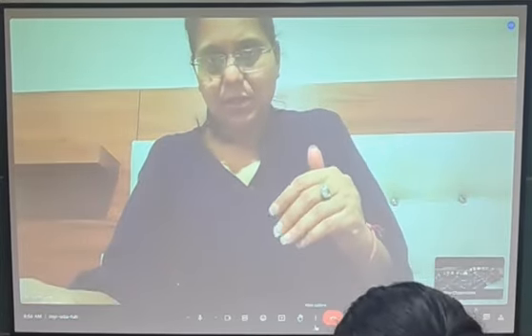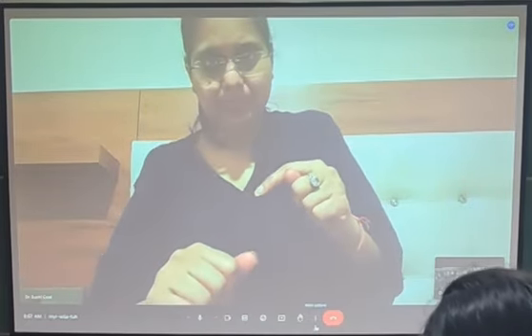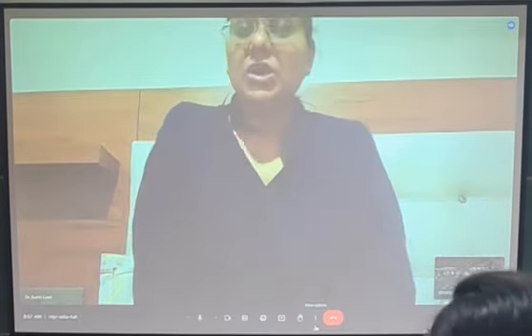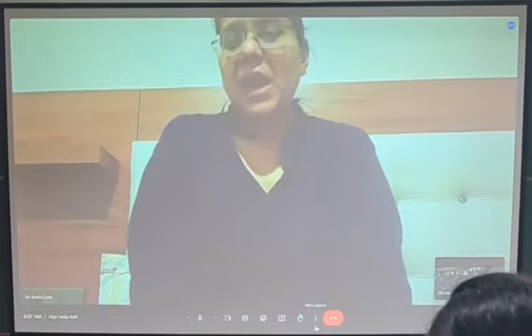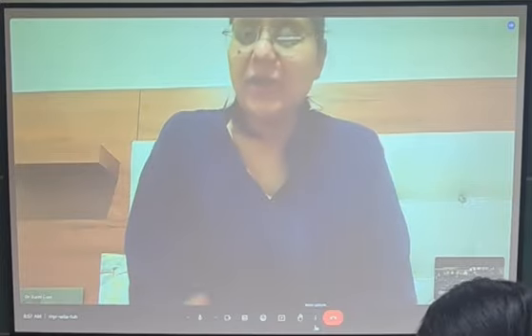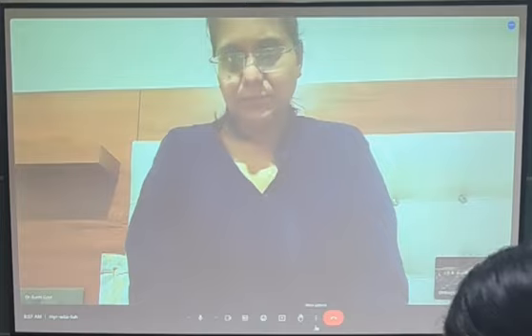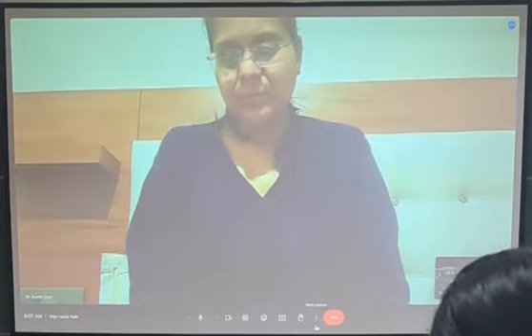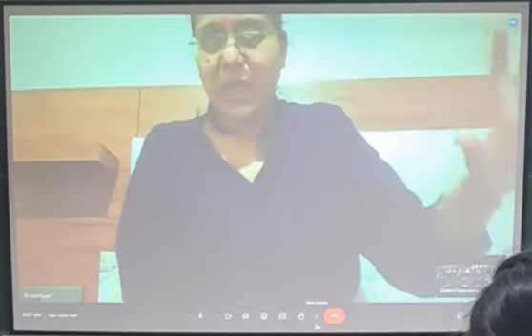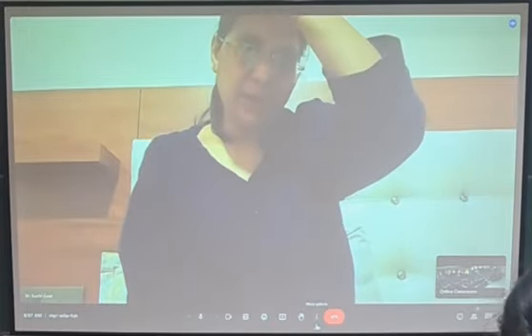But this is still an indirect method of counting. I do not know my CFU per ml. If I say I have an OD of 0.5, it will tell you my bacterial sample has grown, but I do not know the CFU per ml. Then how should I find the CFU per ml? Can you design an experiment with what I have taught you: from this OD of 0.5, how will you calculate the CFU per ml?